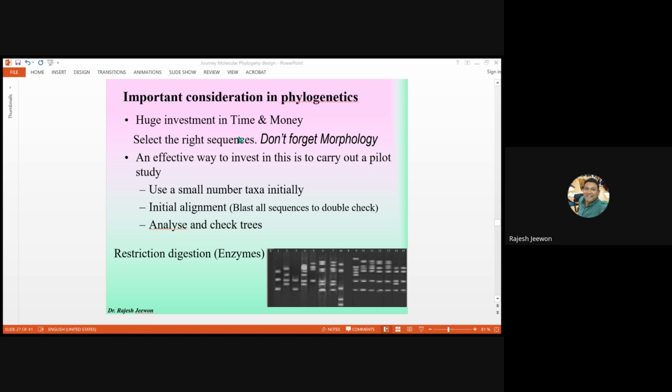So you might think that possibly your sequences are erroneous, but no. Once you check that your sequences are right, it just has something to do with the fact that the number of sequences available in GenBank does not really reflect the number of species available in nature. So obviously, if you're going to BLAST, you're going to BLAST it with that minimum of species available in GenBank. So now it's up to you how you go ahead and interpret your data.